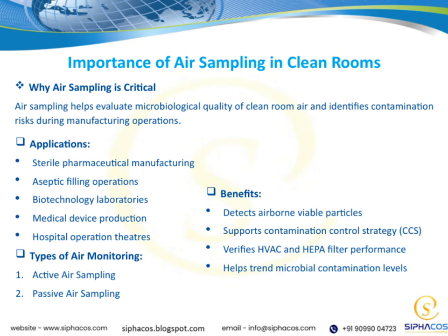they become serious. Ultimately, air sampling is vital because it helps us evaluate the microbiological quality of the air in our clean rooms. By doing so, we can identify contamination risks during manufacturing and take proactive steps to prevent product compromise or compromised patient safety. It's a fundamental part of maintaining the highest standards in controlled environments.